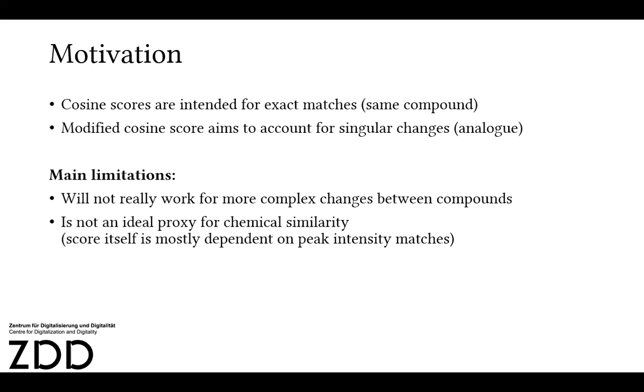And the second thing is the same here, that it's not an ideal proxy for chemical similarity, because what you're asking for is, you look for similar fragmenting patterns. And that might also change depending on your measurement settings, but it might also indeed overlook very high chemical overlaps, especially slightly larger molecules, but with individual changes at multiple places. And so we realized that we were actually after something different in a different project. We were looking for spectra that belonged to compounds with high chemical overlap.